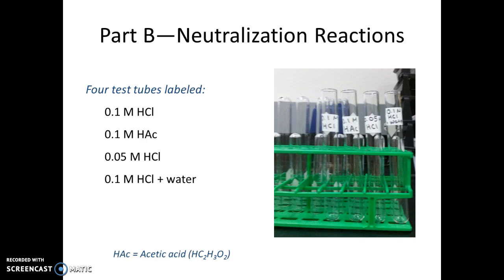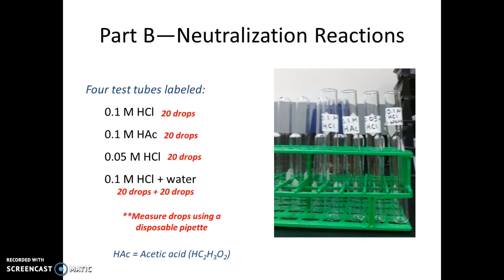In the next part of the experiment, you'll be doing four different neutralization reactions. Label four large test tubes accordingly. A neutralization reaction is a reaction between an acid and a base; the acids used here are hydrochloric acid and acetic acid at different concentrations. Add 20 drops of each acid to its labeled test tube, with the exception of the fourth tube labeled '0.1 M HCl plus water,' which gets 20 drops of HCl plus 20 drops of deionized water for a total of 40 drops.